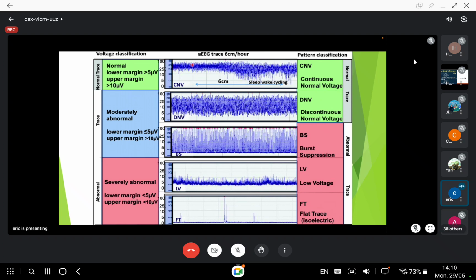So when you look at the activity band, I always tell people to look at the place where it is the most dense. Okay, so if you can see here, actually the dense part is up here rather than all the less dense areas here. You get what I mean? So why is this important?